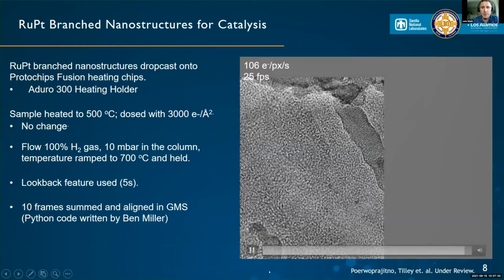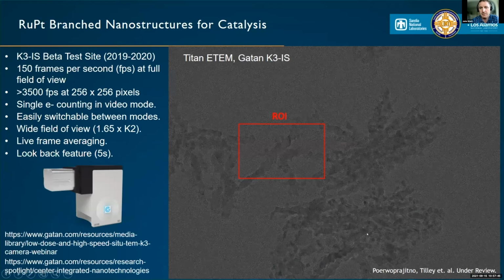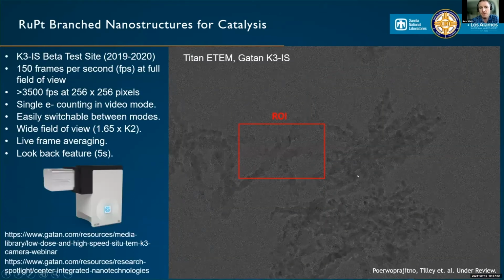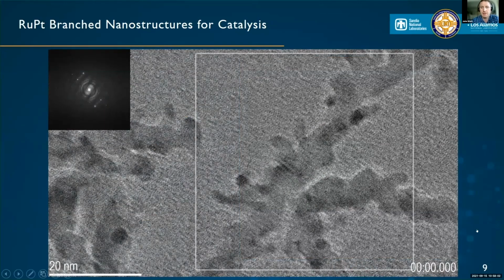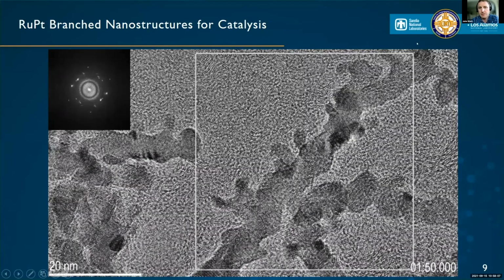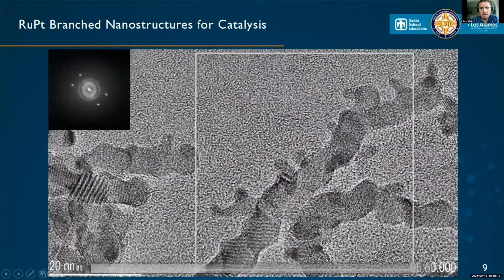This is just another example and kind of shows you the power of the K3. So if I go back here, you can see this huge wide field of view, right? And then we're just looking down at this select region of interest. So even though we're seeing the business happen right here, we still have all of this data out here that we can investigate. We can use things like AI/ML to pick out features and track features. So here is an example of just another larger region of interest. And you'll see we have multiple platinum nodes anneal into these branch structures.